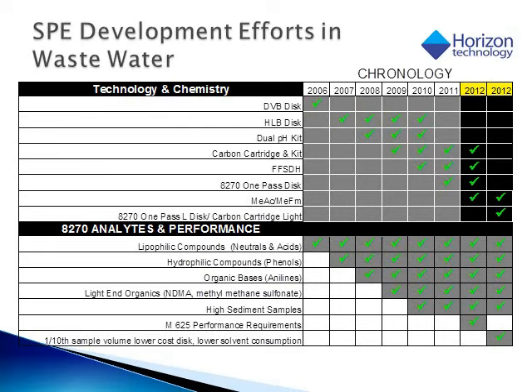The term one pass means that the acidified sample is passed through the disc only once and onto aqueous waste collection. Eliminated is the need to collect the pass-through sample for a basified, high pH, second pass through the disc to capture the organic bases. In 2012, we demonstrated that the method could be performed without compromise with 1/10 the sample volume. This translated into lower operating costs, faster processing times, and importantly, lower solvent consumption.